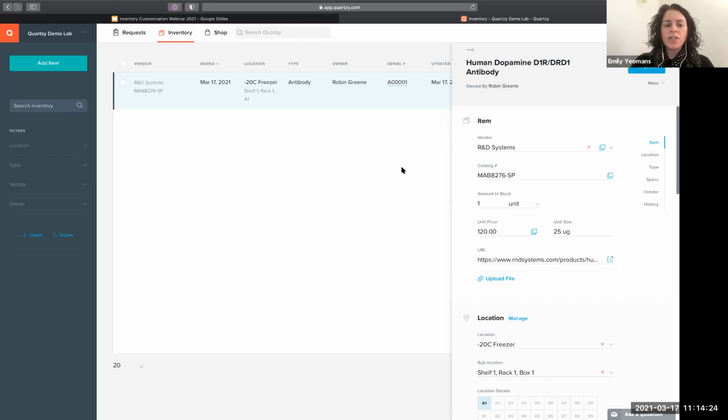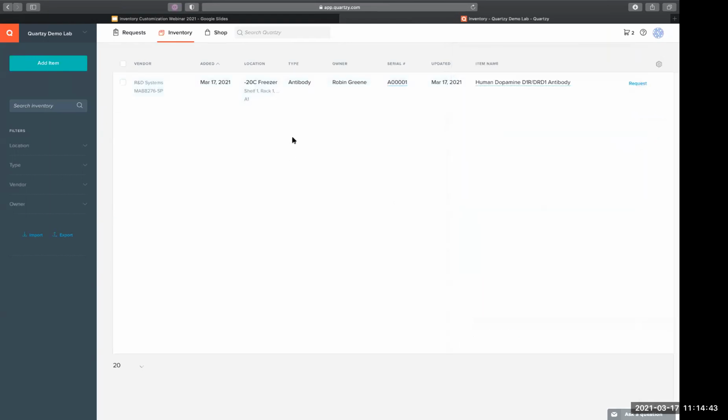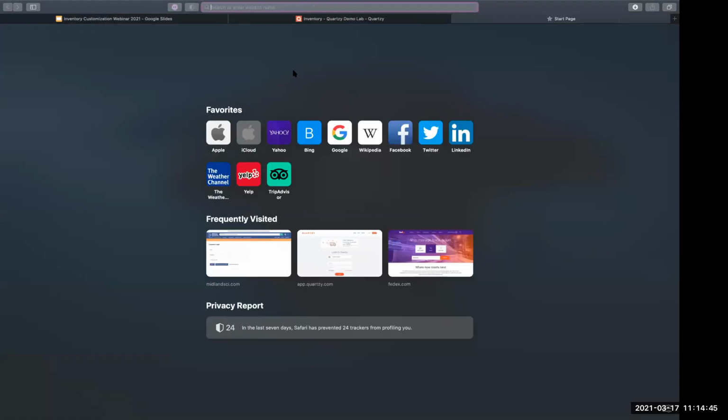Will there ever be a way to change that template rather than change the locations? It's confusing if the box itself has 1 to 81 printed or an alphanumeric that doesn't match the template grid. This is something we'll also go over a little bit later, so maybe I can just bring up that sheet here.